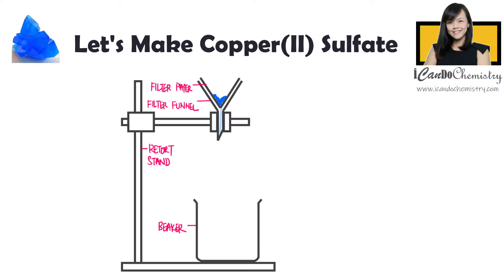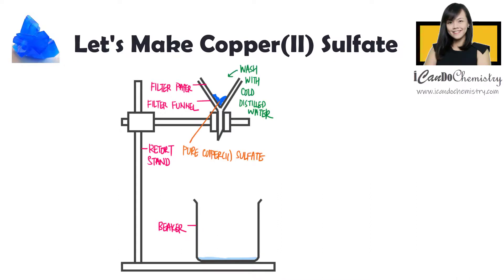Lastly, we will filter to collect the crystals. To remove the remaining impurities, we will wash with a little amount of cold water. We use cold water because copper-2-sulfate salt is soluble — we want to avoid dissolving the salt that we have made. Then we will dry the crystals between filter paper.